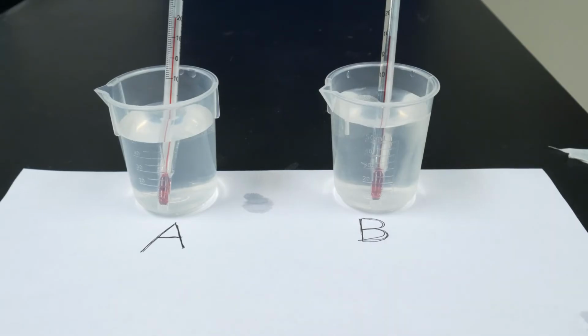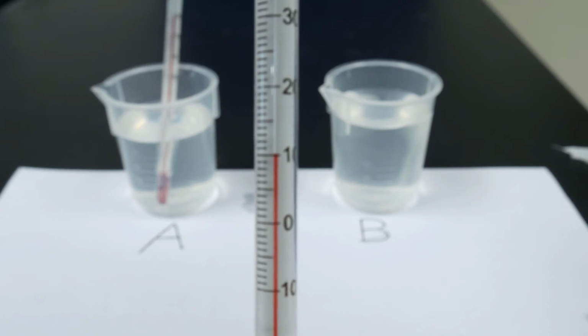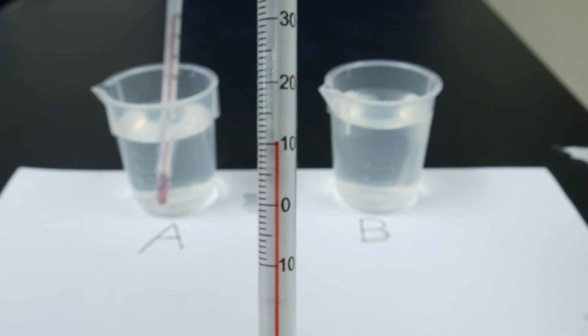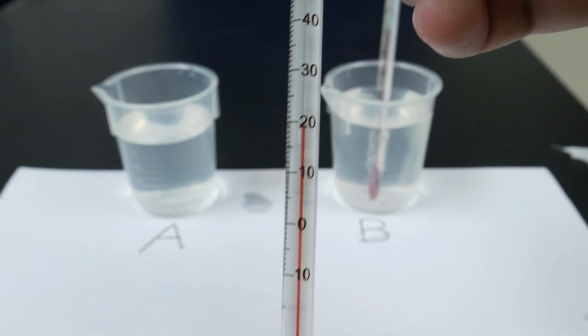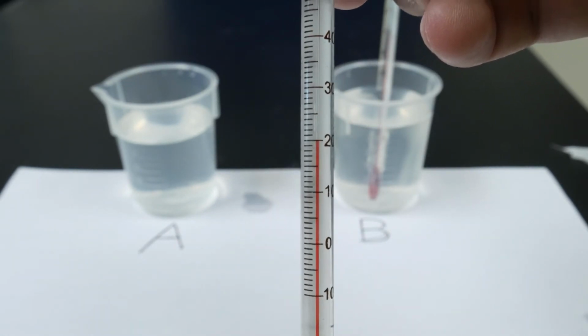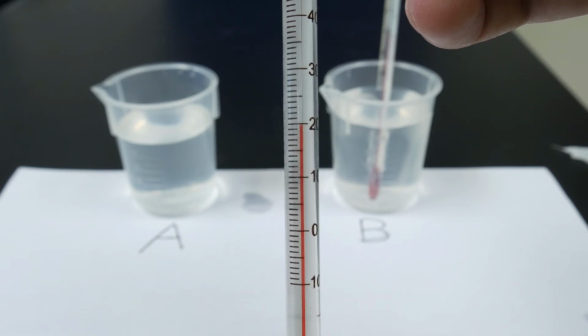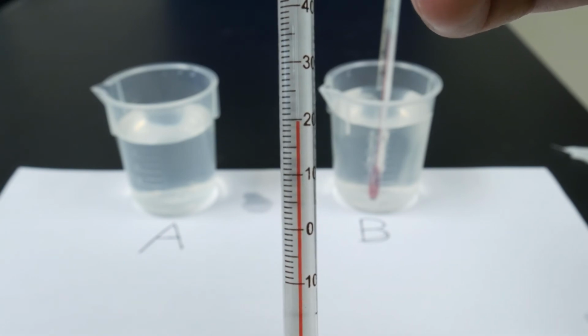All right, so it has been 5 minutes. Let's check the temperature of beaker B here. So after 5 minutes, it looks like the temperature is around 10 degrees Celsius. Looks about 10 degrees. We will check also for beaker A, though I assume it's at 19 because we didn't do anything to it. So let's just check anyway. And maybe it went up to about 20 or so, but not much of a change. So if you want to keep it at 19 or about 20, that should be fine.